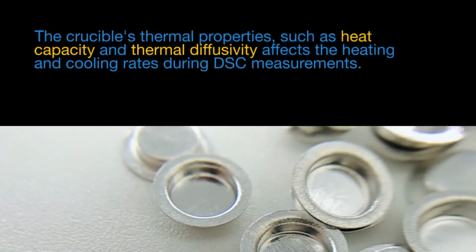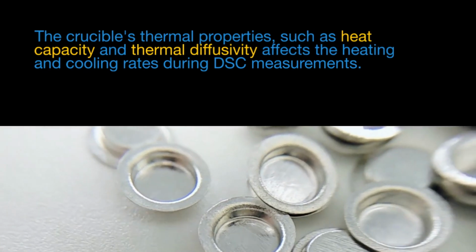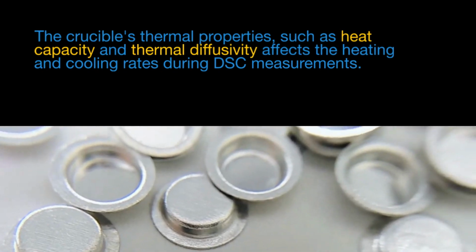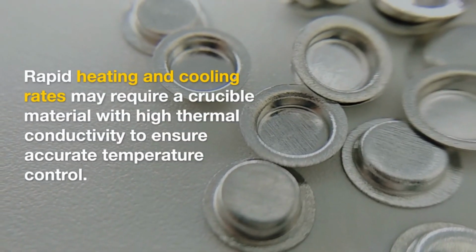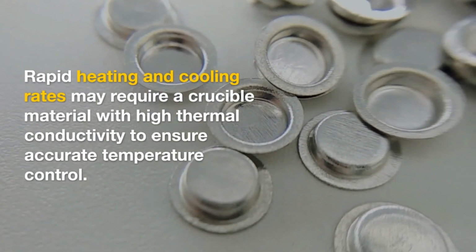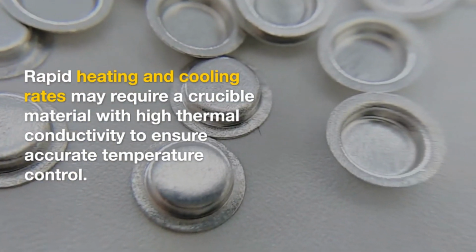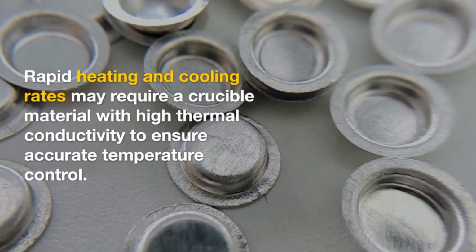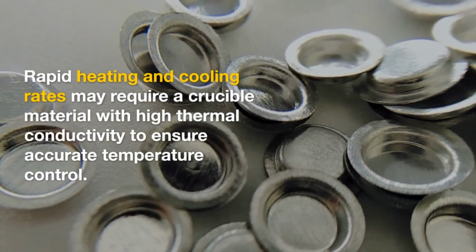The third, heating and cooling rates. The crucible's thermal properties, such as heat capacity and thermal diffusivity, affect the heating and cooling rates during DSC measurements. Rapid heating and cooling rates may require a crucible material with high thermal conductivity to ensure accurate temperature control. Consider the heating and cooling requirements of your experiment and choose a crucible that can meet those requirements.